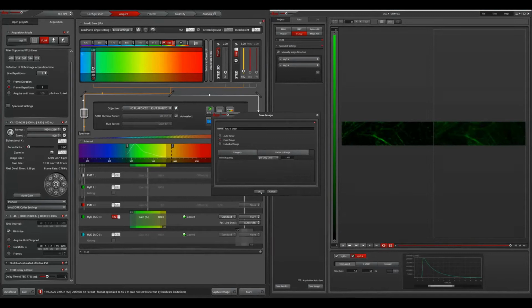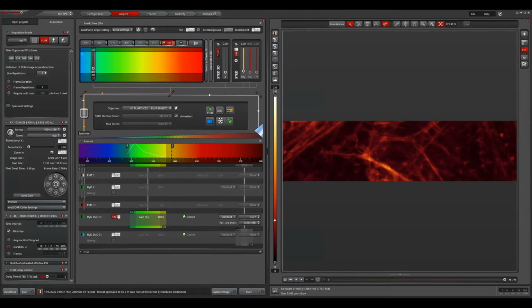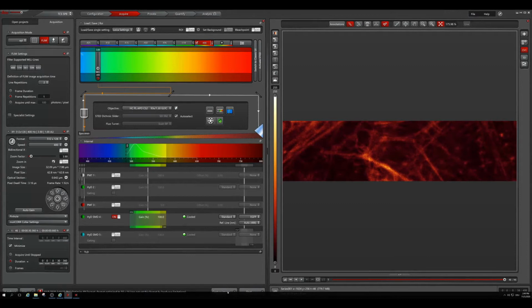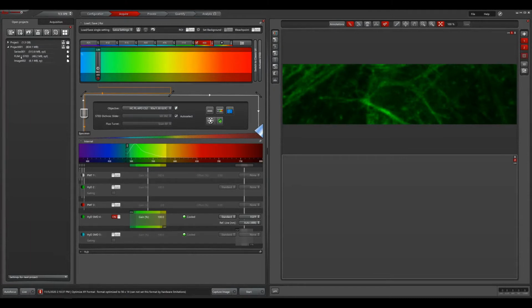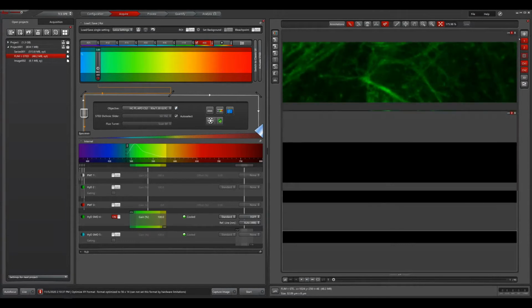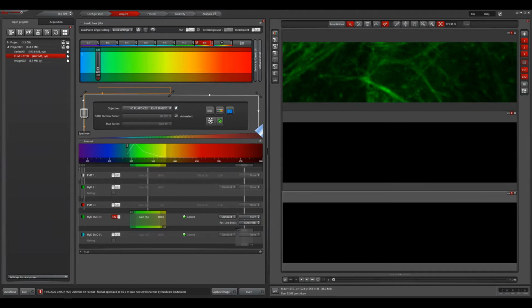So now let's just save these 2 channels as an intensity image, and I will go back now and just acquire 1 additional frame without STED, just in regular confocal, in order to have a comparison. All right, so this is now my pure confocal frame without any STED laser power. And now we'll just open a second viewer here, where we can add both our Tau STED and time-gated STED. And let's do that for a third one as well.